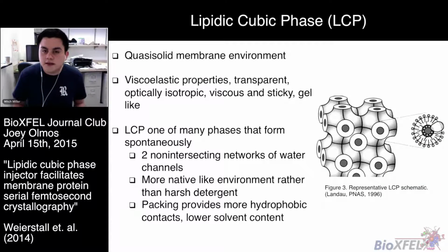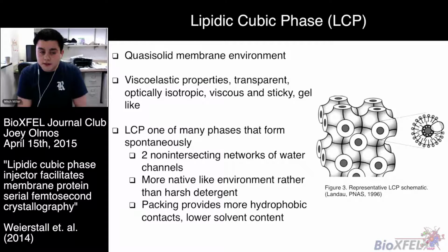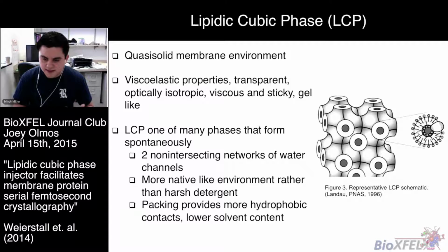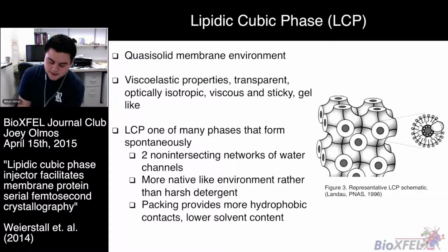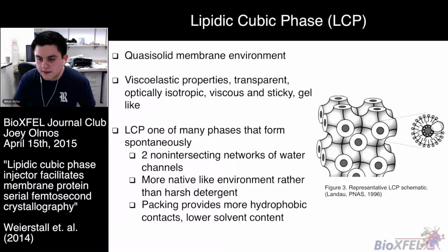So here's a schematic of LCP, right? Hopefully it provides this quasi-solid membrane environment with this viscous and sticky gel-like lipidic cubic phase. And you see here that there are two non-intersecting networks of water channels, right? Those are the black circles shown in the lipidic cubic phase here.